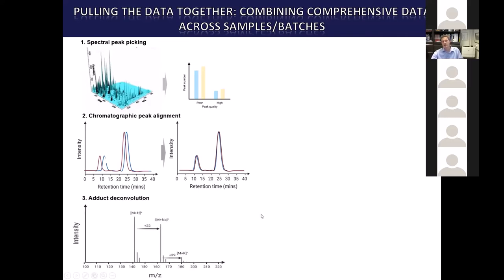And then finally, an important aspect of mass spectrometry: that selectivity is fantastic, but it also comes with a lot of heterogeneity. Those mass spectrometrists amongst you will know all about different types of adducts of the same chemical species, and we see that in biology a lot. There's lots of sodium around, even potassium. We can very easily see three different MZ values for exactly the same metabolite, simply because in the ionization of that metabolite, we see a protonated form, a sodiated form and a potassiated form as well. And of course, we want to capture all of that as representing a single metabolite.